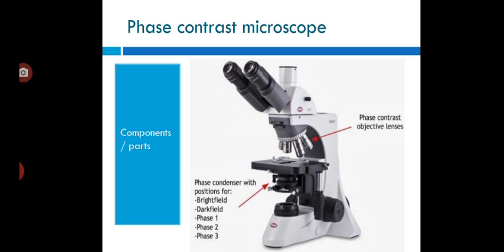Phase contrast microscopy improves the contrast and makes evident the internal structures of cells which differ in thickness or refractive index. The different parts of a cell and its surrounding medium have different refractive indices. Unstained living cells absorb practically no light.